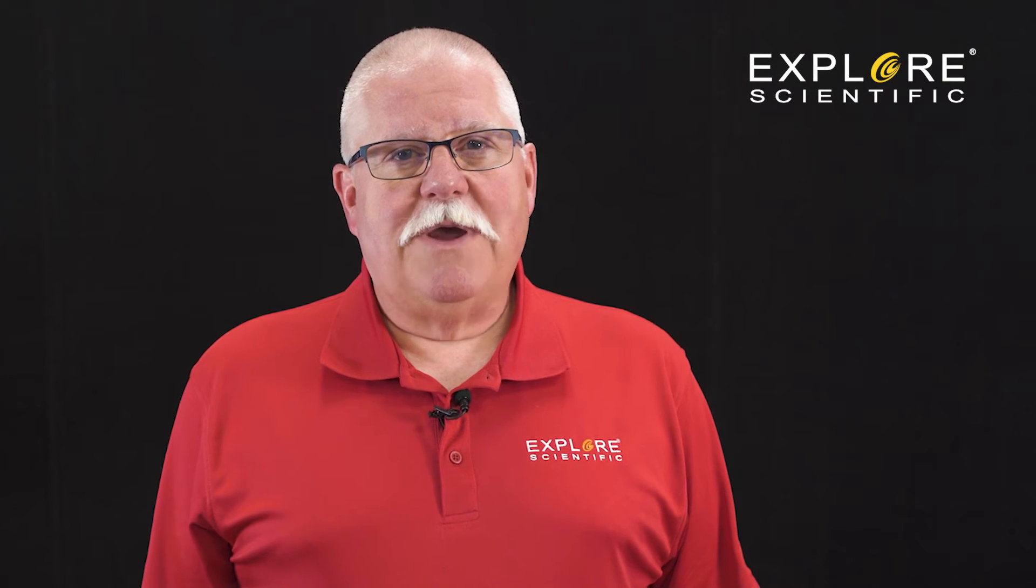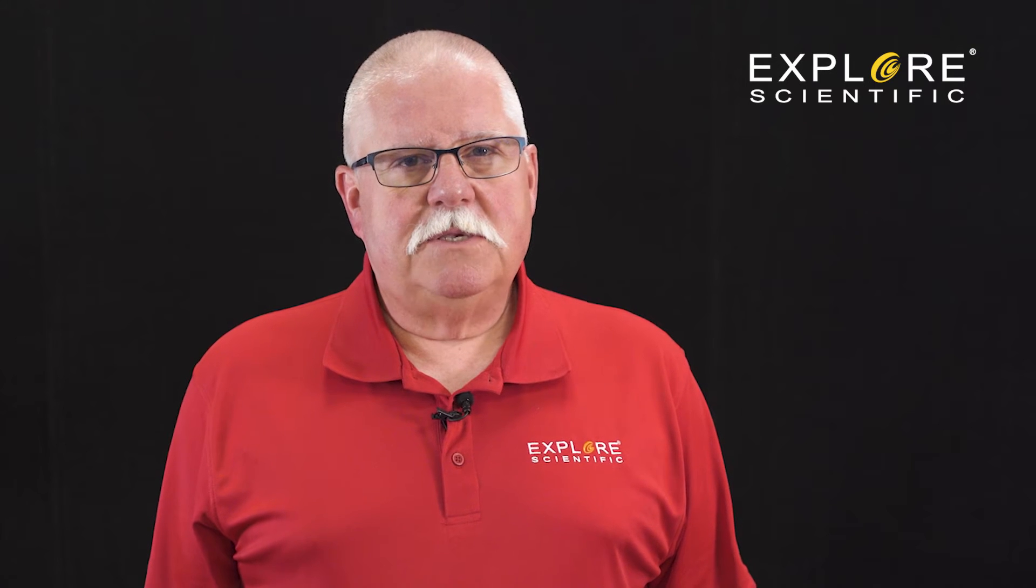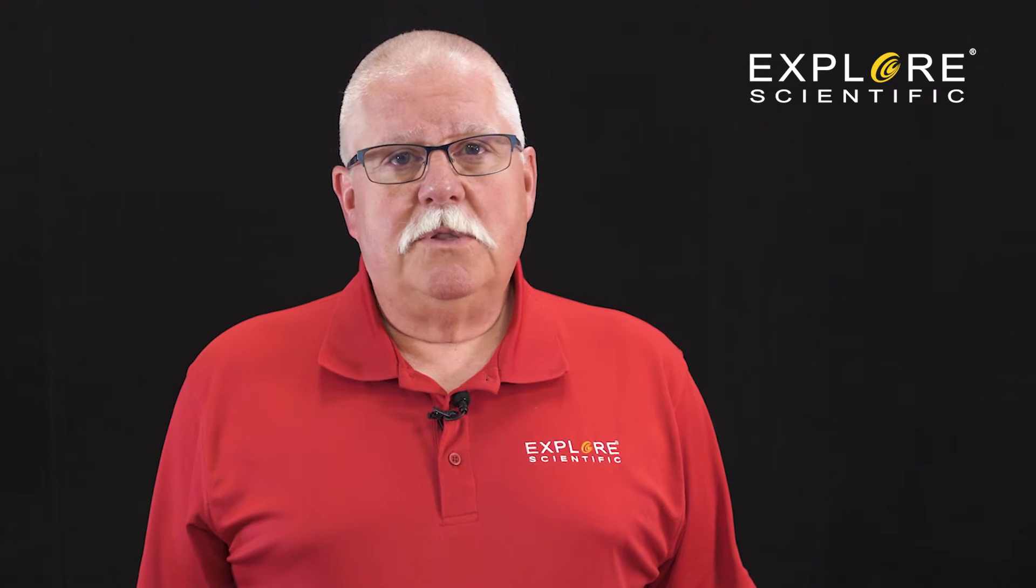Explore Scientific and National Geographic lines of microscopes create a fun and enduring way to learn and explore the microscopic world around us. These microscopes make it easy to learn basic operations and maintenance. In this tutorial, you will learn the basics to quickly assist you in exploration.